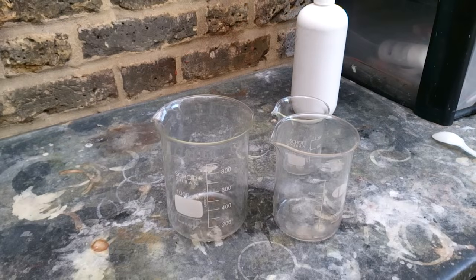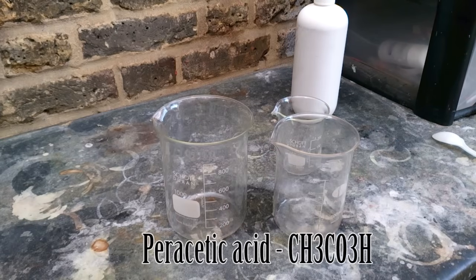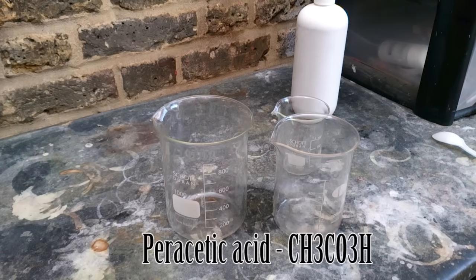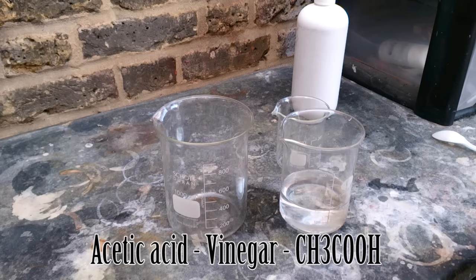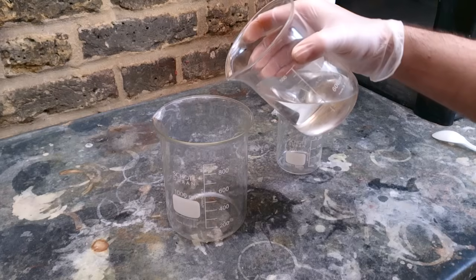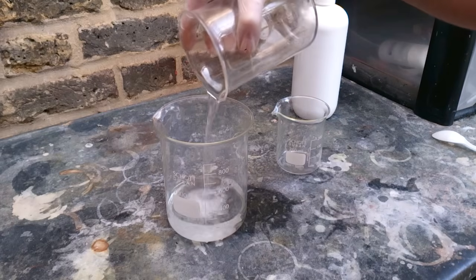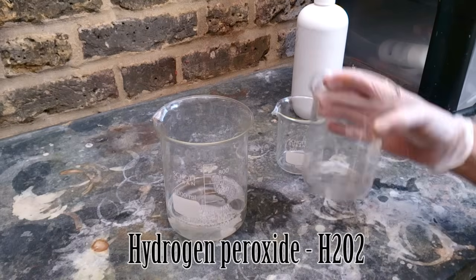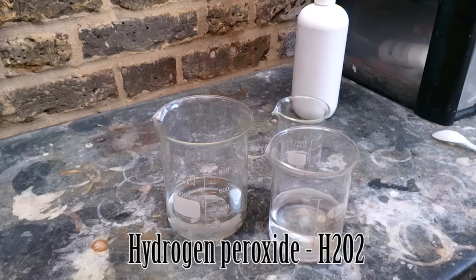So let's get our etching solution ready. Before anything else, pull on your gloves, because one of the reagents is still strong enough to do some skin damage. We're going to make something called peracetic acid. What you need is white distilled vinegar — I'm using 12% vinegar — and hydrogen peroxide. I'm using also 12% hydrogen peroxide.